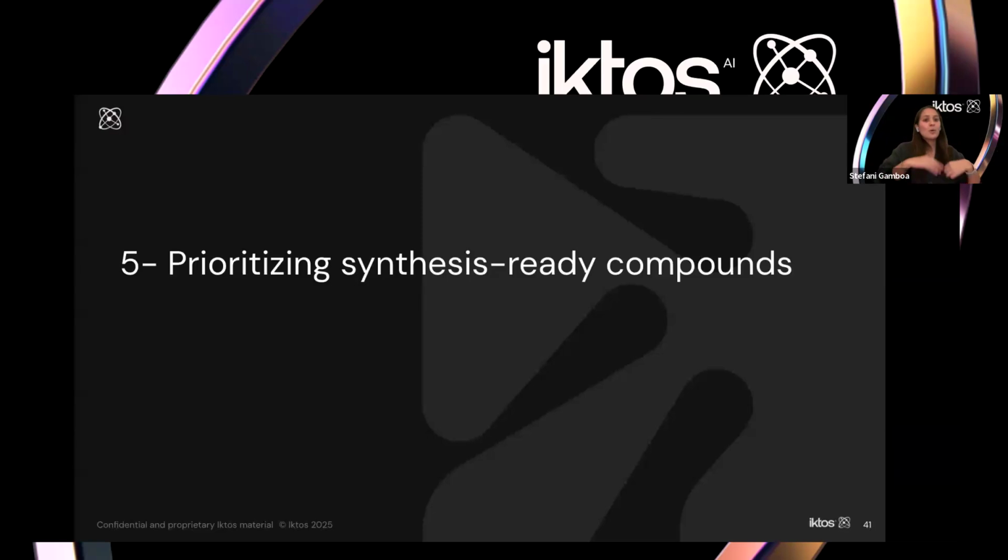So, just the final few minutes of the webinar. We explored how we can use our workflow in order to solve the main problem. But now the question would be, how can we explore if the molecules that we've selected are actually synthesizable? First thing, in Makya we always give you the retrosynthesis goal.